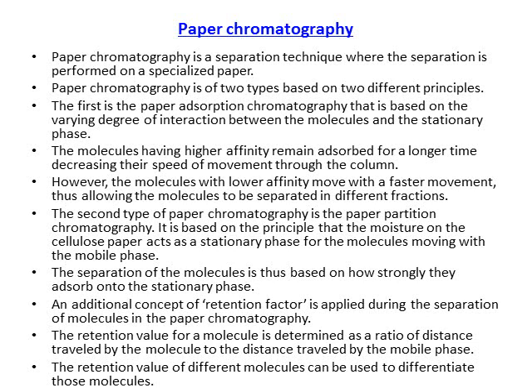An additional concept of retention factor is applied during the separation of molecules in paper chromatography. The retention value for a molecule is determined as a ratio of the distance travelled by the molecule to the distance travelled by the mobile phase. The retention values of different molecules can be used to differentiate those molecules.